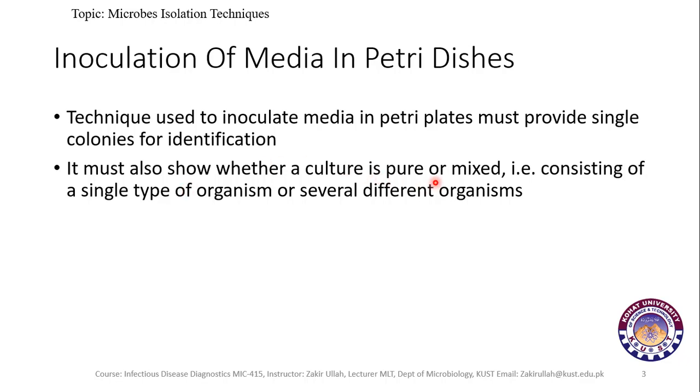If a culture consists of a single type of organism, that is called a pure culture. And if multiple organisms are grown and they have different sizes and types of growth colonies, these are called mixed cultures.